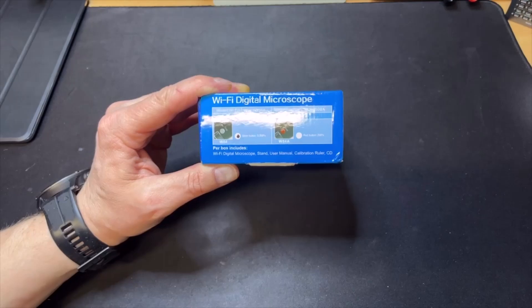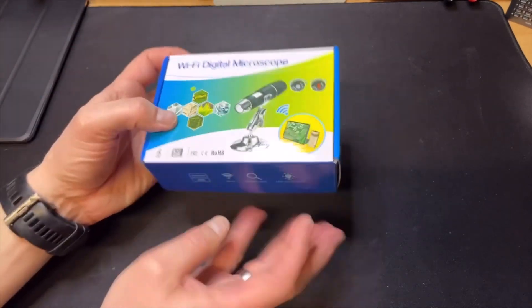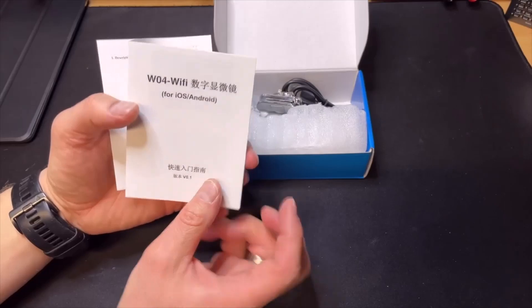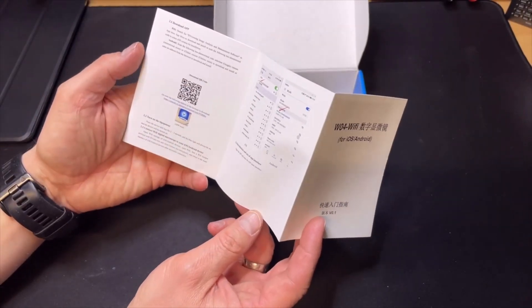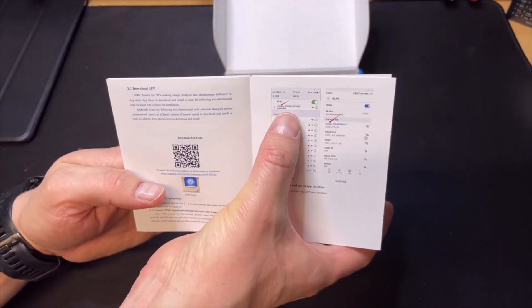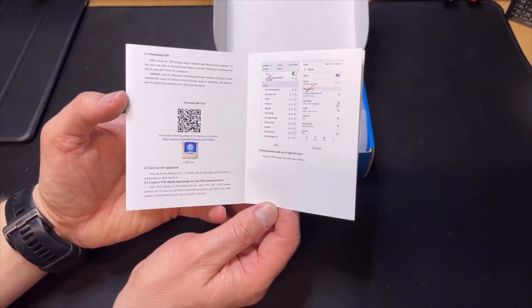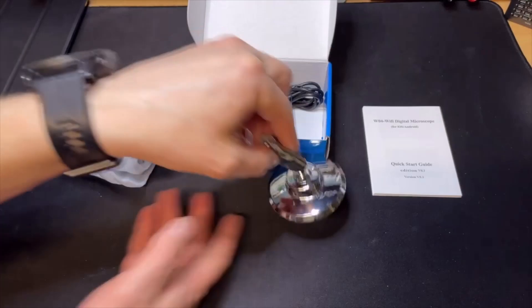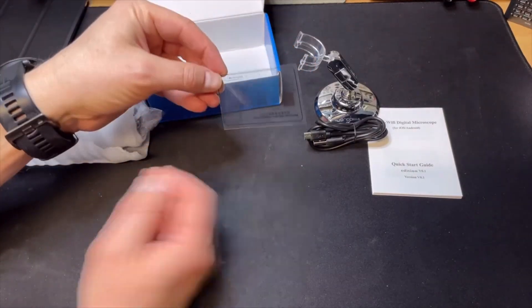As soon as you have the Wi-Fi version, the resolution just drops — maybe because of the transfer speed you cannot have the higher megapixel model. There is a little manual in the box. It requires iOS or Android, so you cannot use it on your PC — I did try that. It also has USB to charge and some sort of calibration sheet.